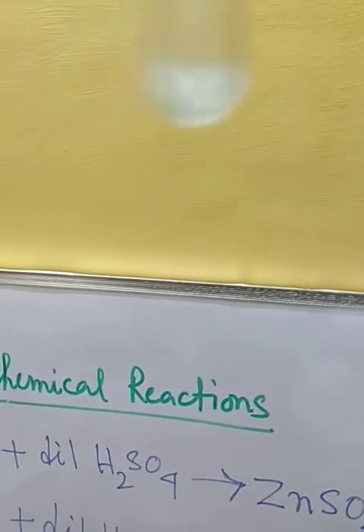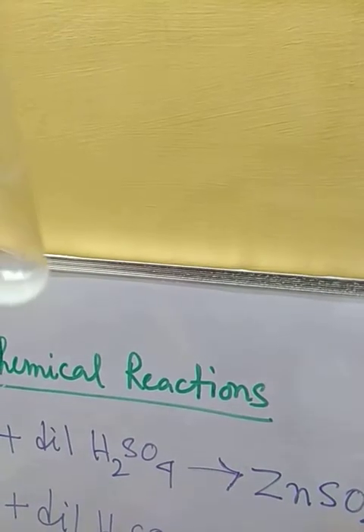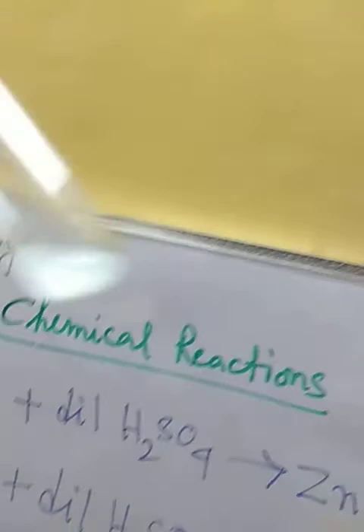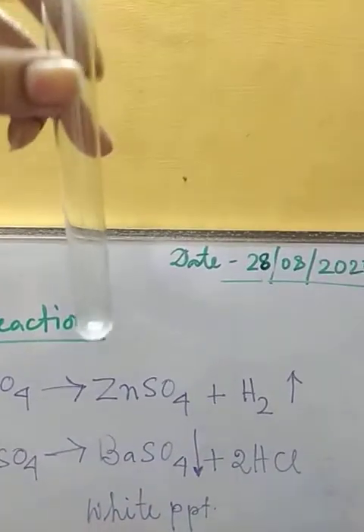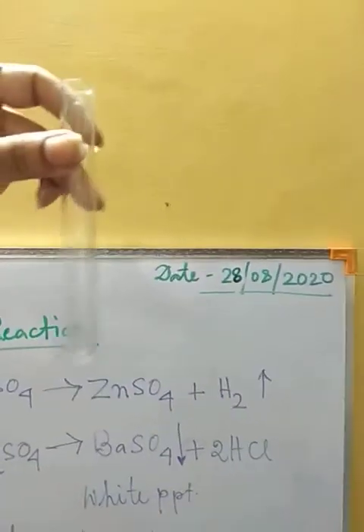As we have curd, the curd gets separated from the watery part of the milk, the watery part of the curd. In the same manner here also we are getting the watery part, the solution, and the precipitation separated in this manner. That's why it is called curdy white precipitation. This is the precipitation of silver chloride, AgCl. So that's it.